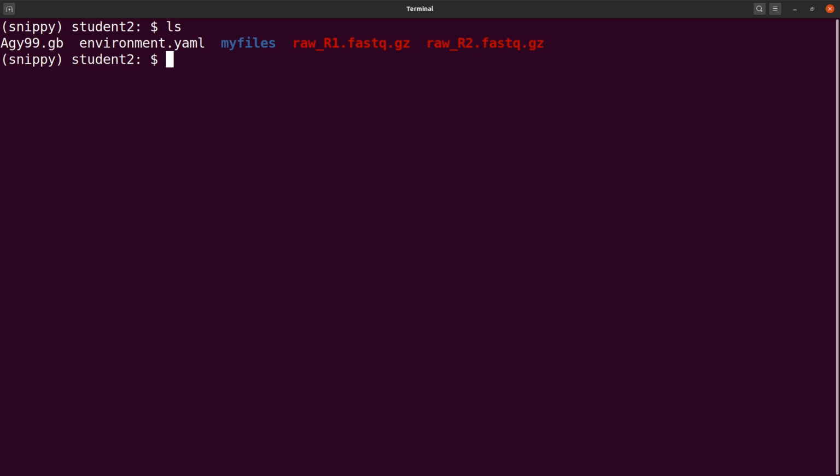So just know that it is important to inspect your reads if you are going to do analysis on NGS and sequence data. So take note of that. Now let's get back to work. We are going to look at how we will do the trimming.